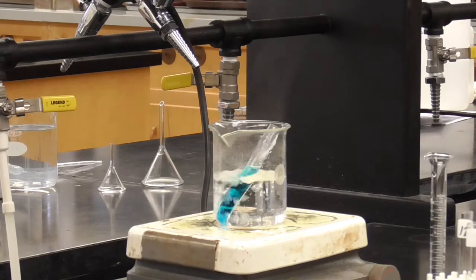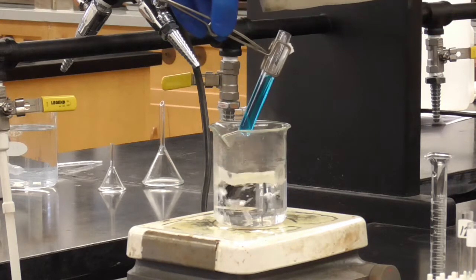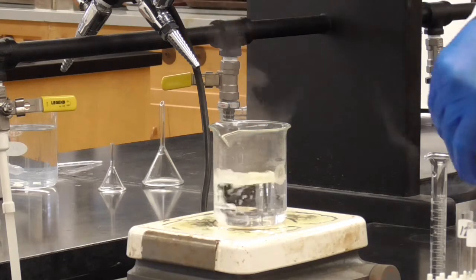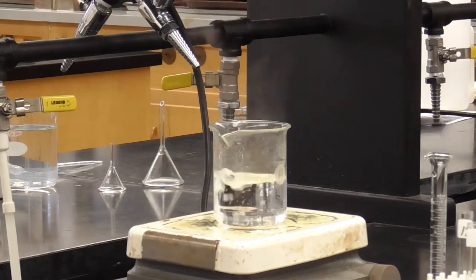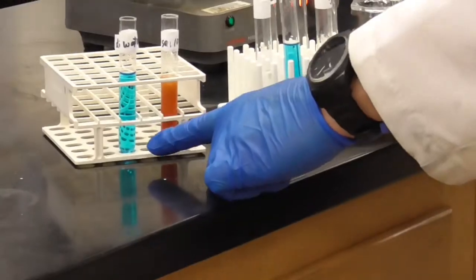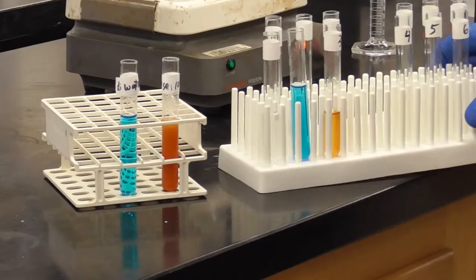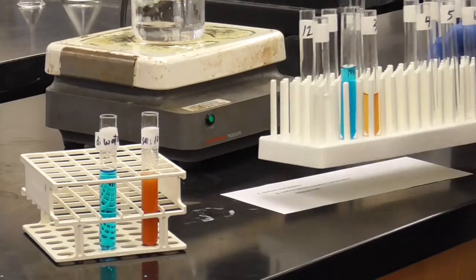Okay, it's been about 5 minutes, and this has been heating. Let me go ahead and take that out of here. And this is, again, the glucose test. Oops, my label just fell off. That's okay. The glucose test lines up fairly well with our negative control. And so all 3 tests from that water initially are negative.